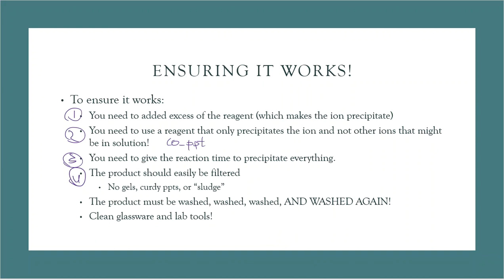Next, number five, another problem area that people just stop at for some reason. I don't understand why, but they never rinse their precipitates. So what this means is that you're going to have to bring in a lot of water, or a solvent, some kind of wash solvent. Typically it's water. So in this lab experiment, you are going to want to wash.